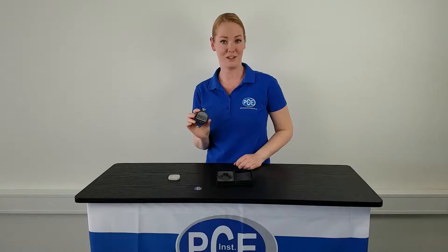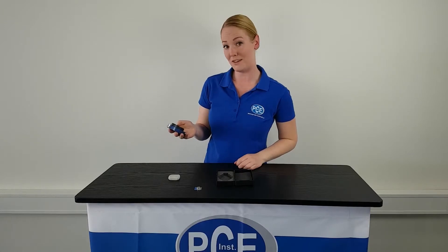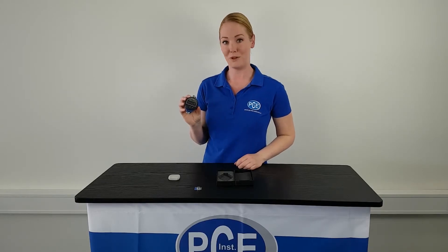Now the measured value is frozen and can be read in peace. To establish another value, press the HOLD key again, and the device is ready for a new measurement.